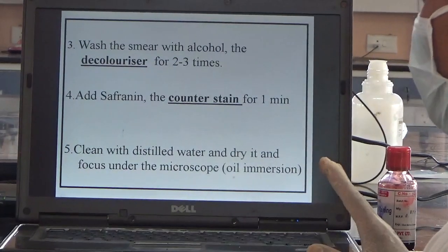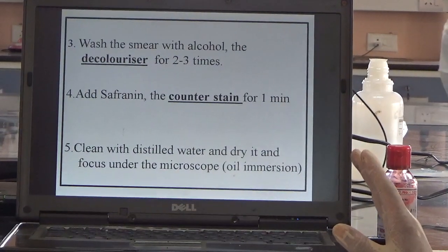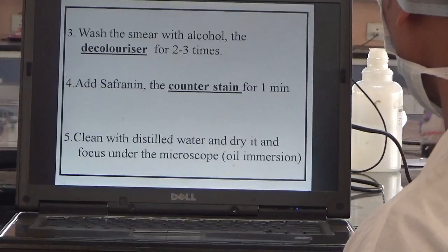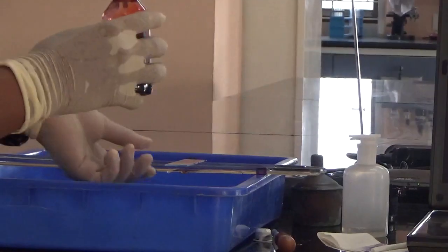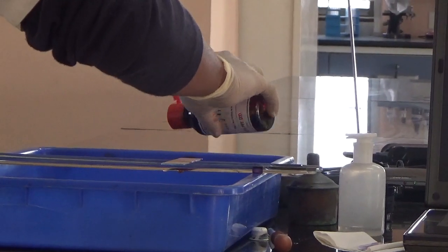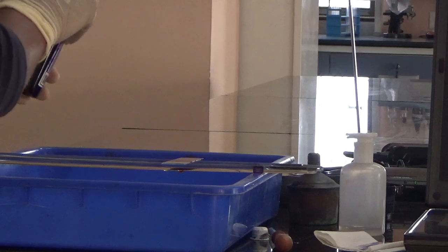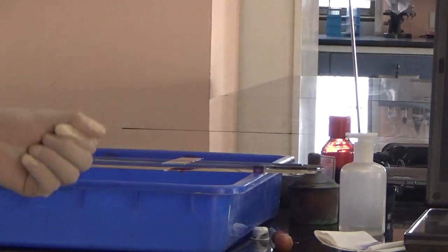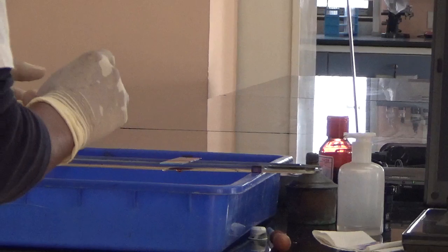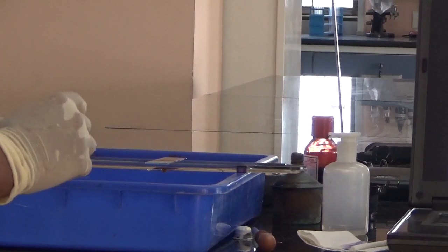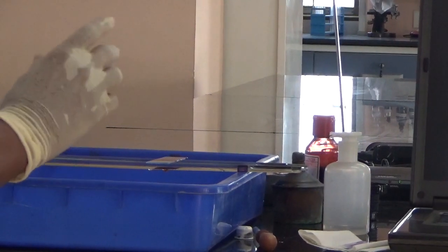Then add safranin, which acts as the counterstain, and wait for 1 minute. After waiting 1 minute, wash it with distilled water, dry it, and focus under the microscope using a 100x oil immersion objective.